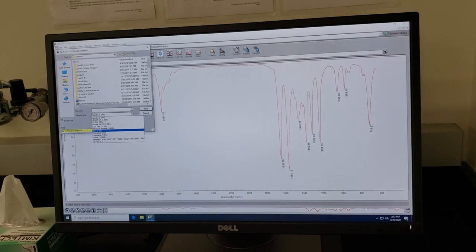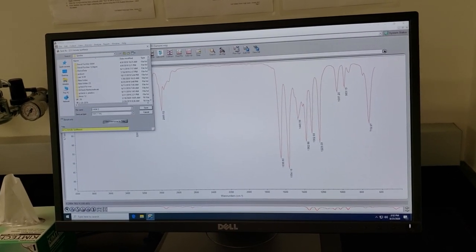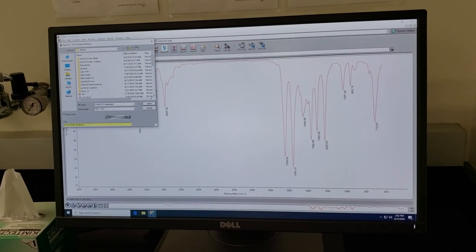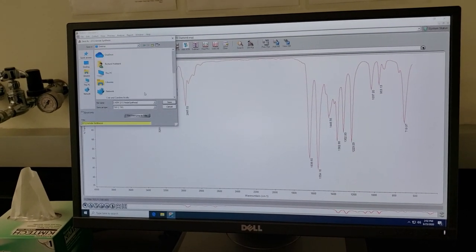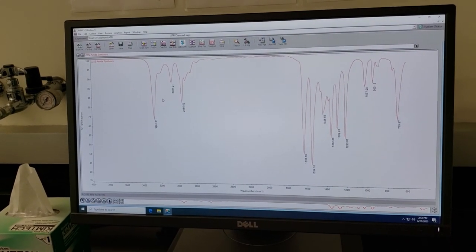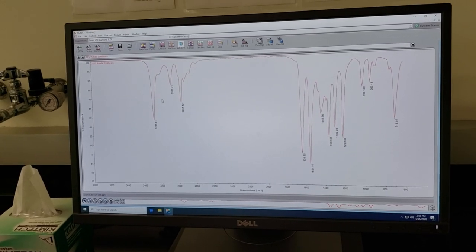We'll save this as a TIFF. Save it to the desktop, and we're all set. All right, so now we'll move on to the picospin to get our proton NMR.